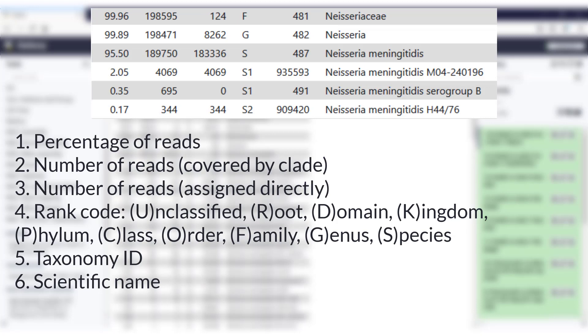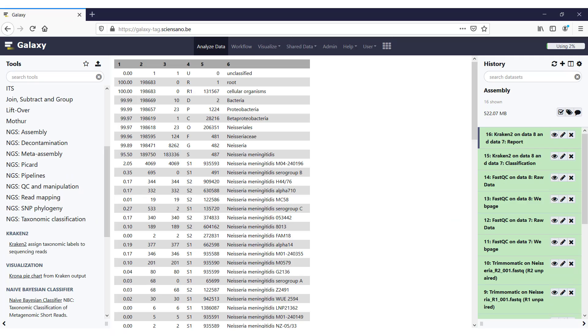In the fifth column, we find the taxon ID for that taxon, and in the sixth column, we find the scientific name. If we look in our results, we see taxon ID 482 and 487, which we saw a lot in the first lines of the previous output. And these are actually the genus Neisseria and the species Neisseria meningitidis. So we see a total of 198,471 reads assigned to the genus Neisseria, or any lower rank starting from that genus. 189,750 were assigned to the species Neisseria meningitidis, of which 183,336 were assigned directly to that species, and the difference was assigned at a lower rank.